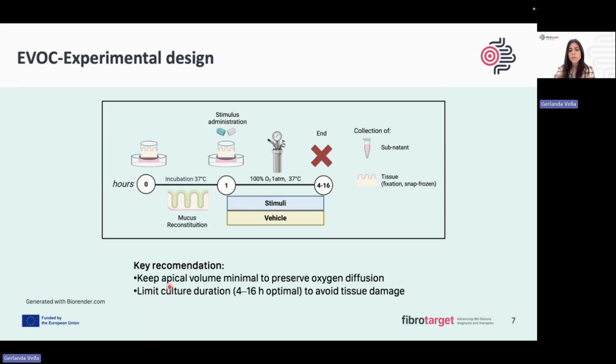Some key recommendations are to keep the apical volume minimal to preserve the oxygen diffusion, but also to limit the culture duration to a maximum of 16 hours to avoid tissue damage.